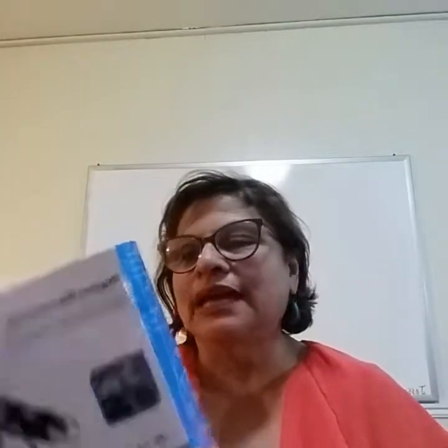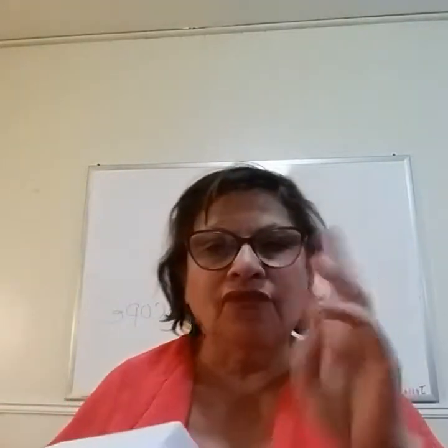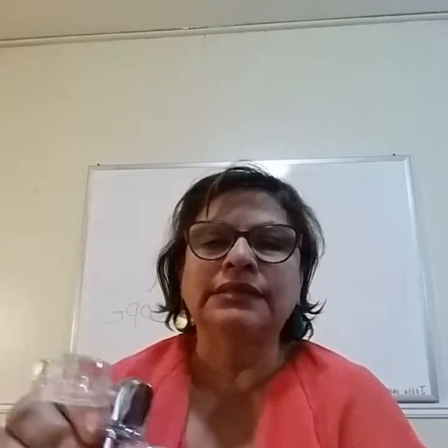I thought this would be fun to try and see if it really does a good job. I paid 30 dollars for this. Let me pull it out of the box — it has a sleeve that's a little tight. In the box are four items. The first is this little stand, which has a clip, a tightener knob, an adjustable part, and a base.